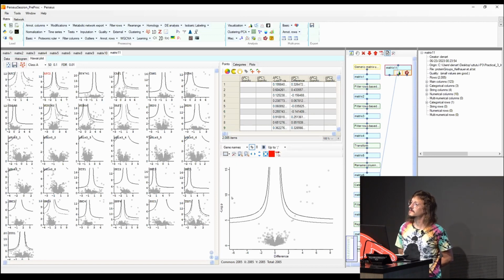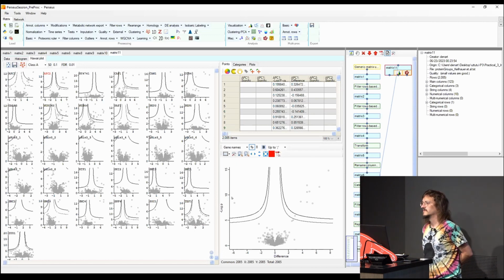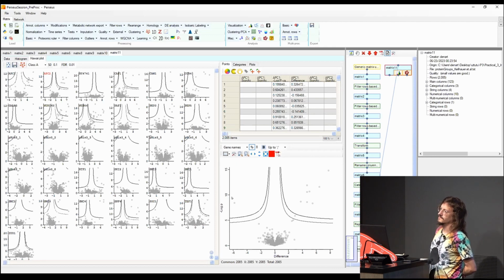The second question? Hi. Since there are so many replicates in each condition, is the imputation necessary? Can we just leave the empty value there? We just don't do anything about the missing value. Just leave it there. Is that okay?